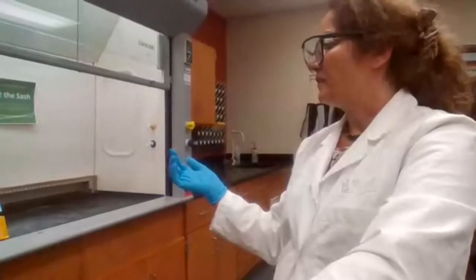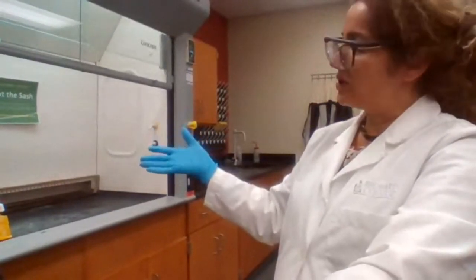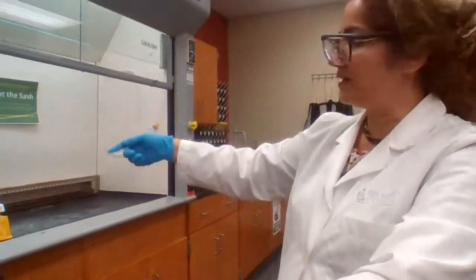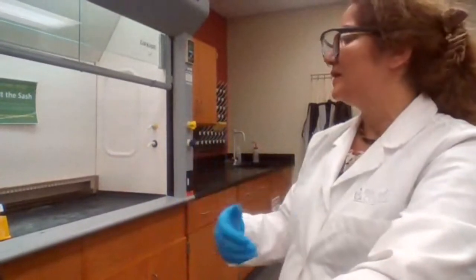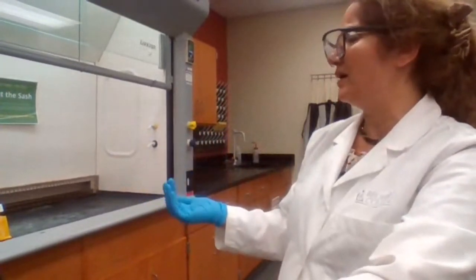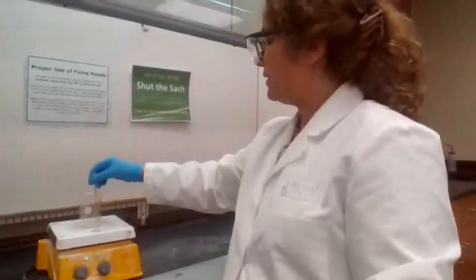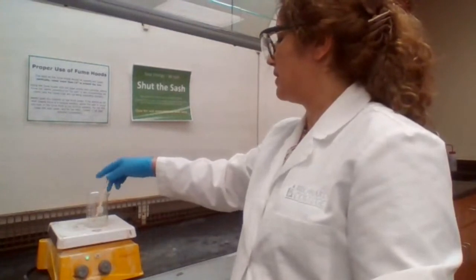But for me, I'm not using a thermometer, also for safety, because the thermometer could be heavy and I don't want to leave it there. I also don't want to take some of the product out with the thermometer, to keep the percent recovery high. I monitor until it stops boiling, and when it does stop boiling, I know the ether is gone.